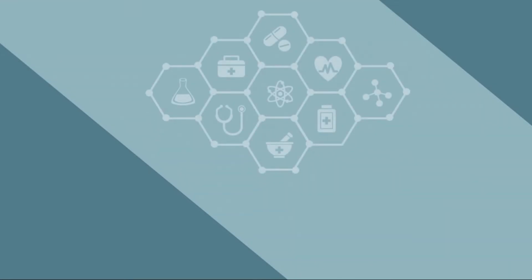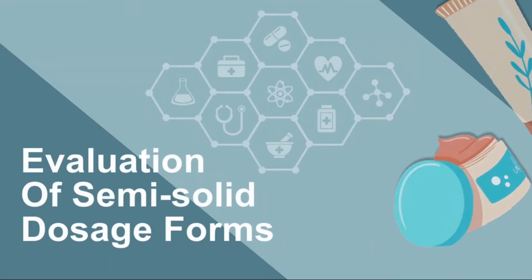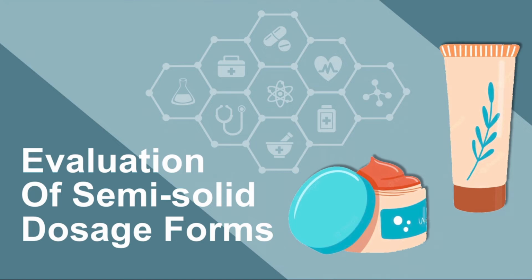Assalamu alaikum warahmatullahi wabarakatuh. In our video, we will discuss the method and test for evaluation of a semi-solid dosage form.